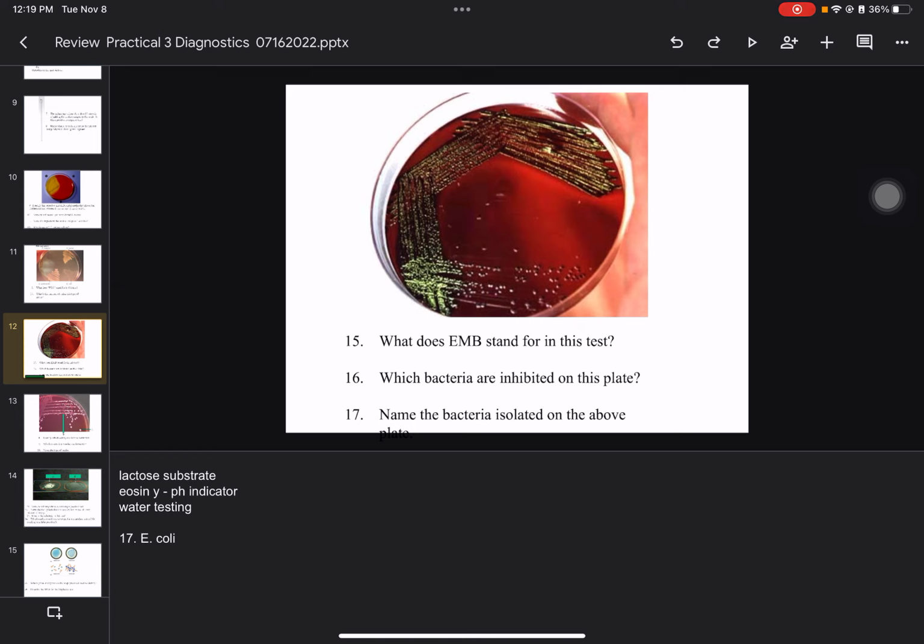It's in the PowerPoint. So essentially, the bile esculin test in combination with 6.5 percent sodium chloride. You run them in tandem. You have to run them together. Bile esculin and 6.5 salt have to be run in tandem. You have to use them both.